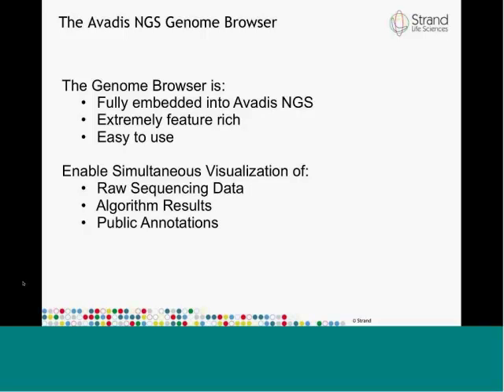For those of you who are already using Avadis NGS, you probably know this, but for those who are new to the software, Avadis comes with a fully embedded genome browser that is extremely feature-rich and easy to use. The fully embedded part should be pretty obvious, but I hope that by the end of this presentation, you will take my word on the feature-rich part and the easy-to-use part as well.